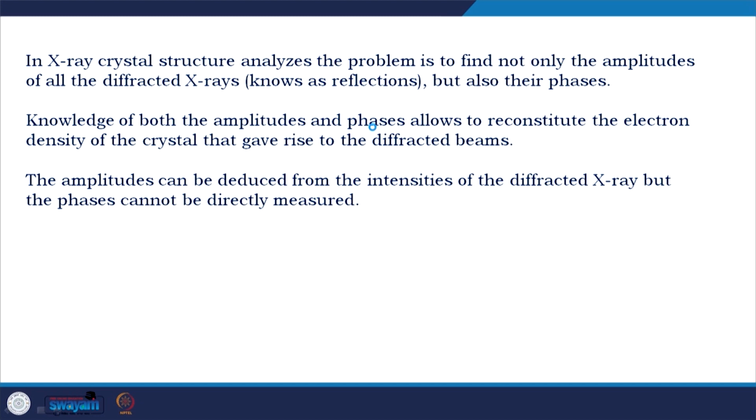So, you have a crystal, it is an array of molecules, you hit it with a X-ray, and when the X-ray hit the atoms, then you get intensity and you calculate amplitude.